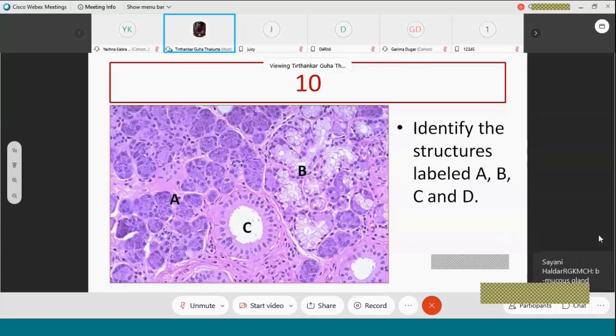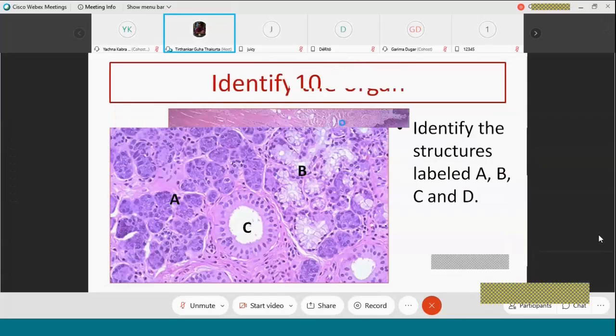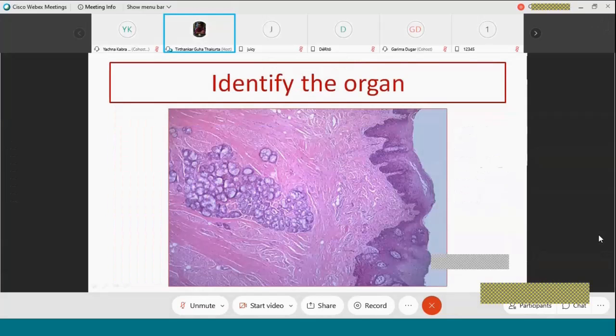And this epithelium-lined round structure is probably the cylinder through which the secretions are drained. So this is a duct, and therefore indirectly we can also say that we are dealing with an exocrine gland here because it has a duct. You can see another duct just below. So these are all ductules or branches of a duct that will join to form some kind of a bigger duct. Wonderful. With an idea of these individual tissues, now I will show you structures.